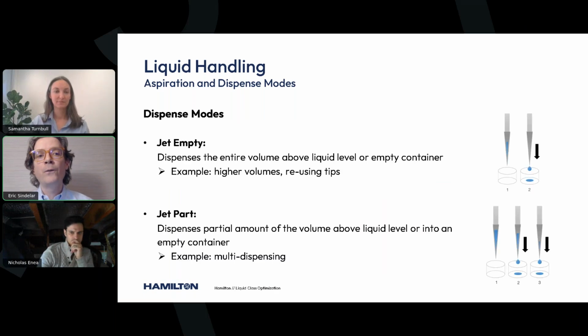So we have 4 different dispense modes. The first 2 up here are jet empty and jet part.